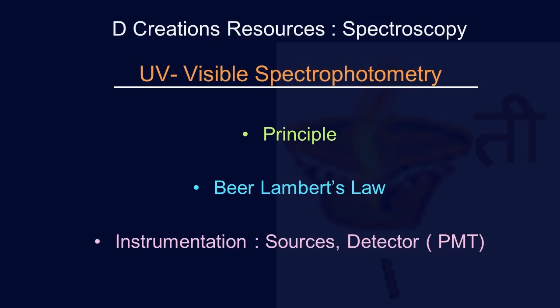So many times in spectrophotometers, it's UV vis NIR. So UV visible and infrared, near infrared to be more specific. And PMT is highly sensitive. It has fast response time, and also it produces minimal electronic noise. So that goes for higher precision in the measurement.